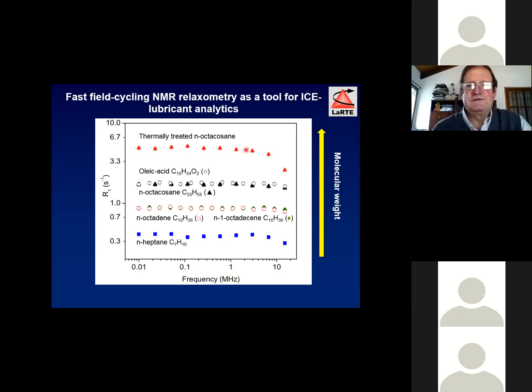It's much more efficient. Maybe the intake of oxygen here is due to oxidation and some chemical changes in the molecules. And also, maybe there is an increase in the molecular weight here. So this shows that there is a dependence on the length of the chain in this case. And okay, this may be a branched alkane at this moment.